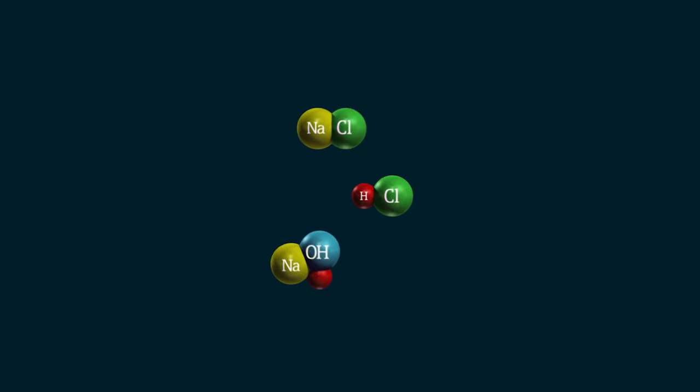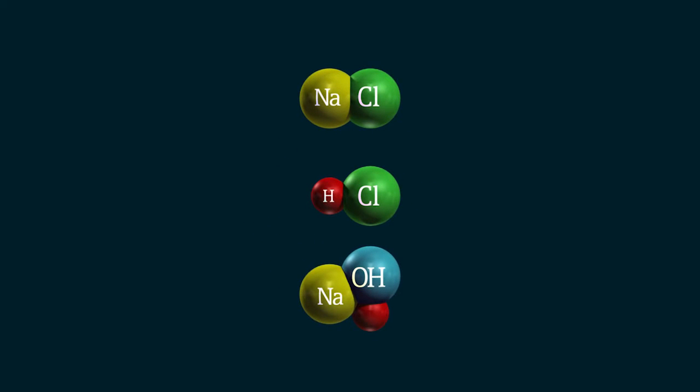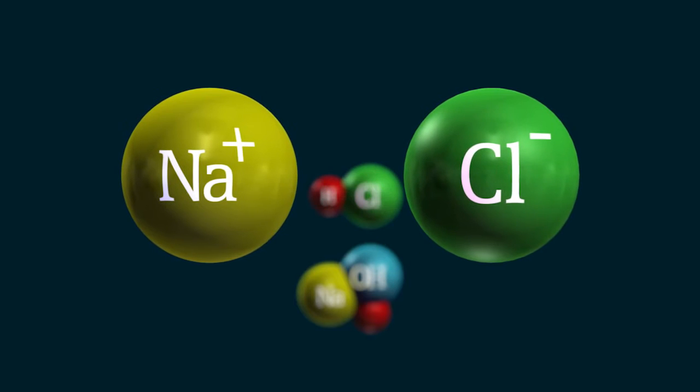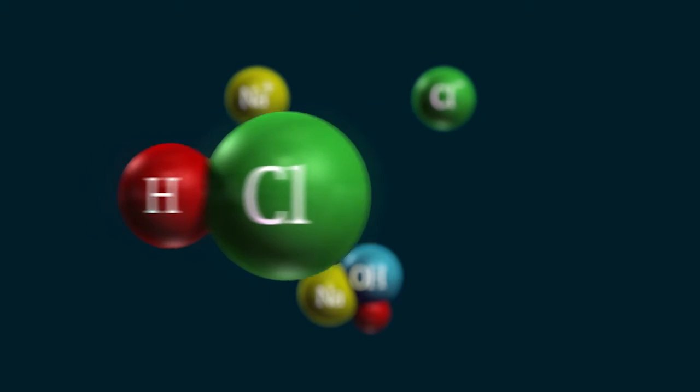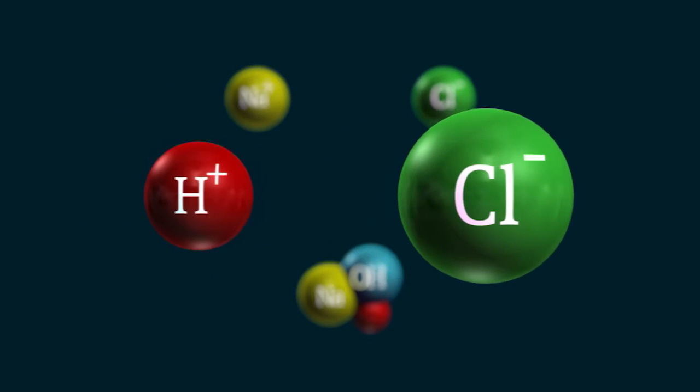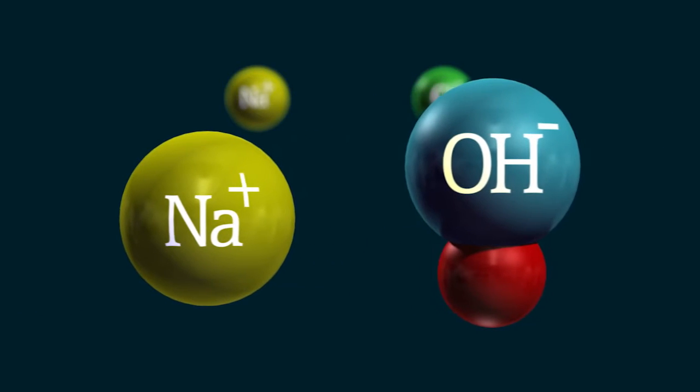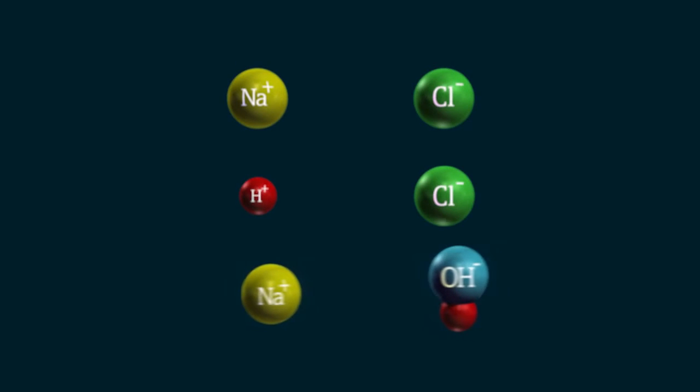Let's start with a closer look at why liquids are conductive. The electrical conductivity of a liquid arises from the dissociation of soluble salts, acids, and bases to form positively charged cations and negatively charged anions. These ions contribute to the charge transport in the electrical field and thus to the current flow, just like electrons in a metal.